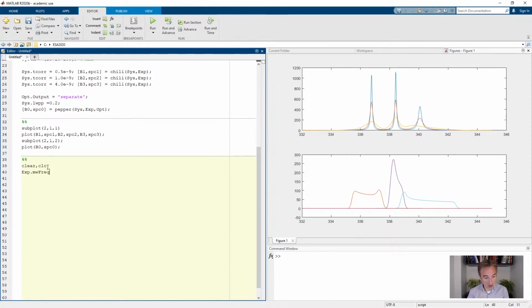Again, let's start out with an absorption spectrum at 9.5 gigahertz. Let's define a system, just a very simple spin 1/2 system with g values 2 and 2.2 and a little bit of convolutional broadening of 0.5 millitesla. And now let's set the correlation time anisotropic, 30 and 0.1 times 10 to the negative 9.